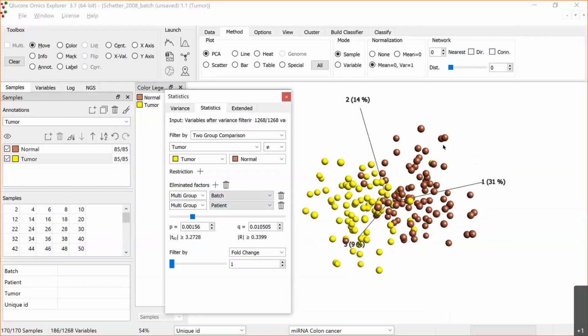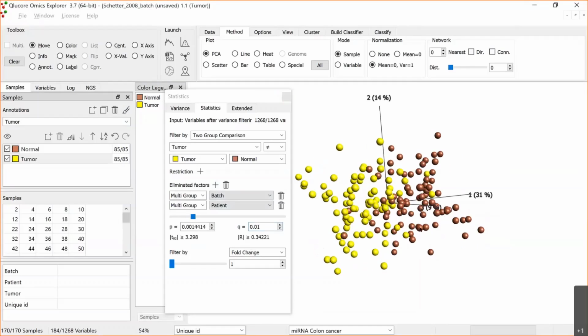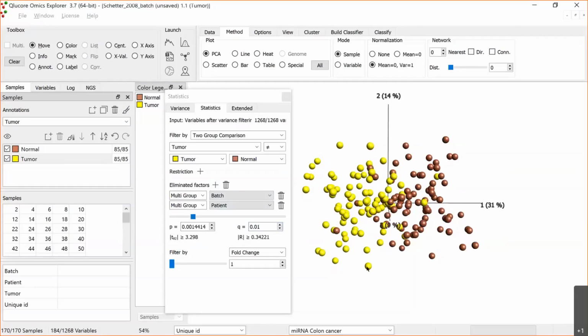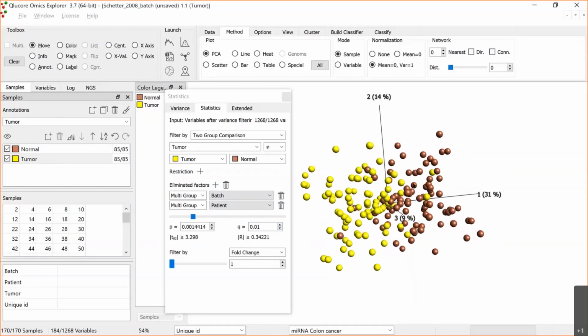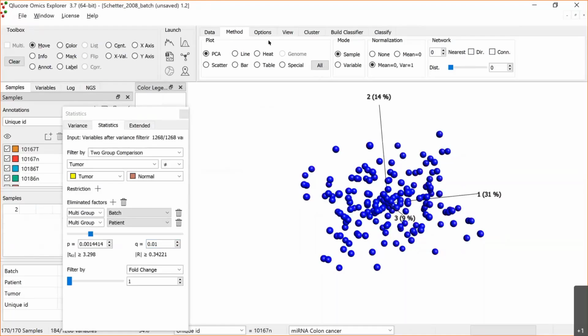And here I now find actually a few more variables than before, like that. No big difference in the outcome, but still. And you know, of course, if I continue and show a little bit of workflow here, then I can have a look at my results here.